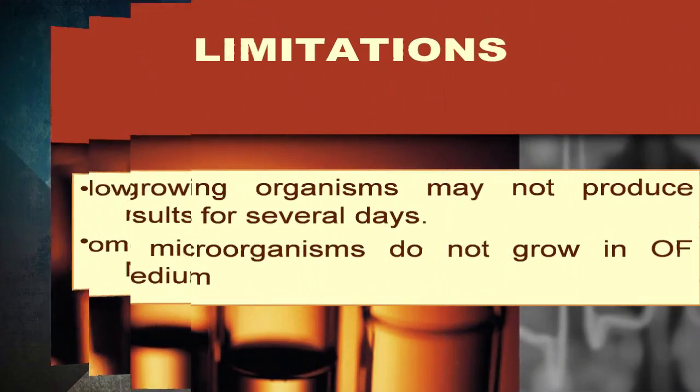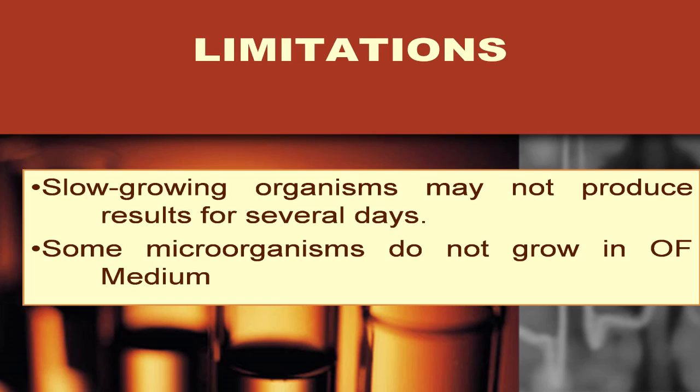The limitations of this test are, first, slow-growing organisms may not produce results for several days. Second, some microorganisms do not grow in the OF medium. It may be necessary to use another basal medium containing dextrose to confirm the negative reaction.